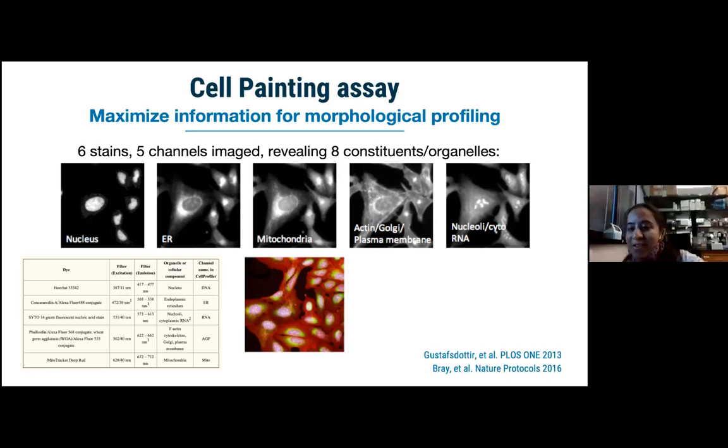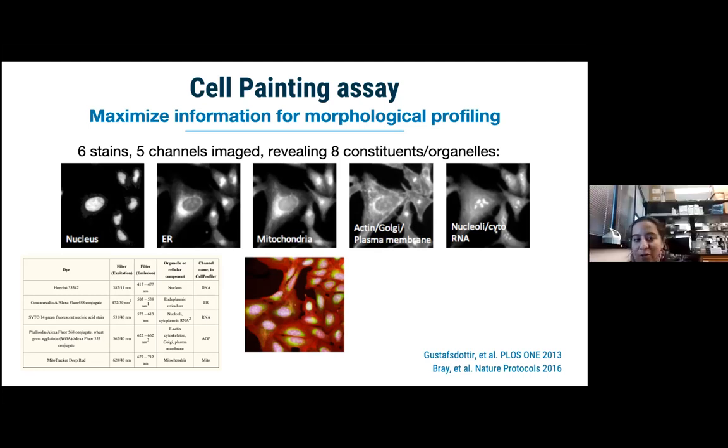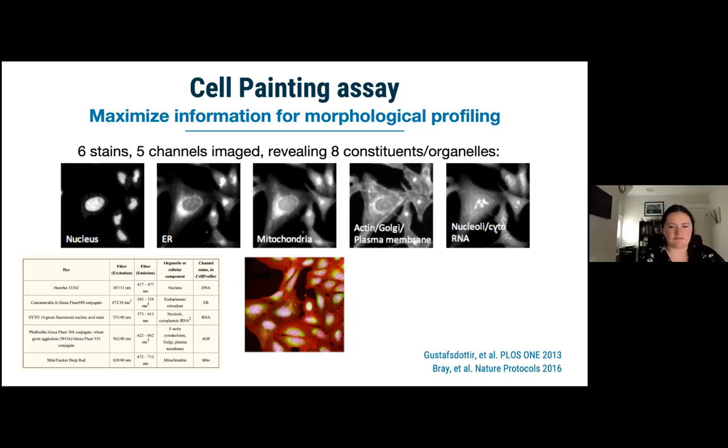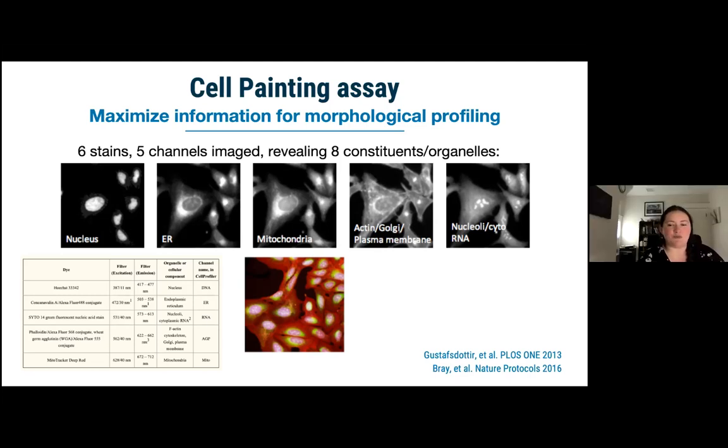Hi, so in your drug discovery program, do you compare your data based on whether cells are looking healthy or not, or are there any measurements that you go for? And another thing is, in CellProfiler, is there an inbuilt module to compare the cells, whether they are healthy or how different they are?